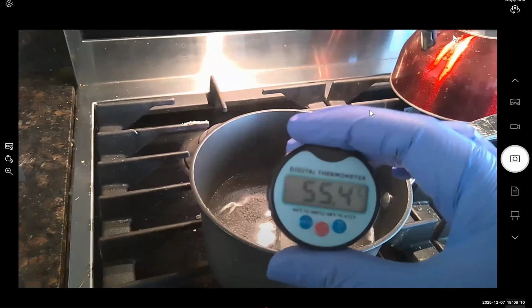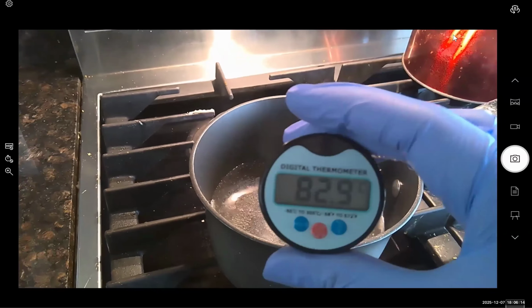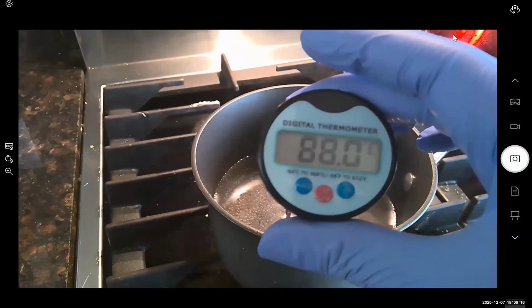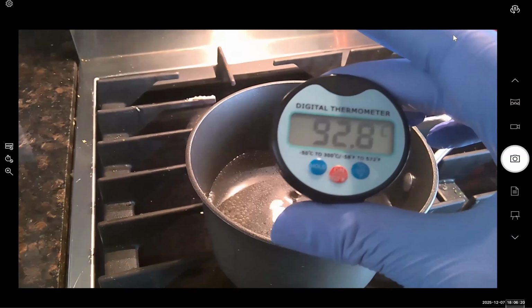So I'm recording the temperature of the boiling water bath using my digital thermometer. As you notice, we're going to wait for this temperature to settle before we record a temperature reading.